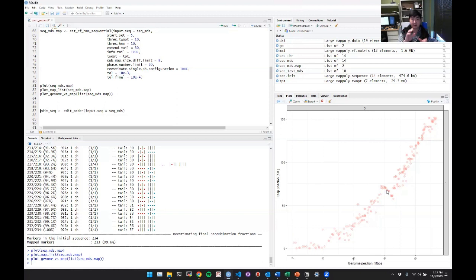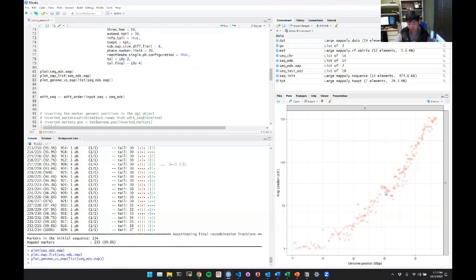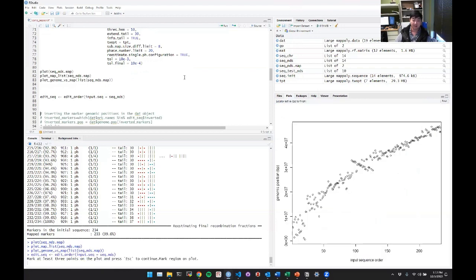So there's a comparison paper where they compare the two reference genomes, and there's this inversion. What we can tell from the linkage mapping side is that this particular reference genome may have it wrong just in this small area. So now that we know this exists, what we're going to do is edit the sequence. And this is just another representation, but this is a point and click version.